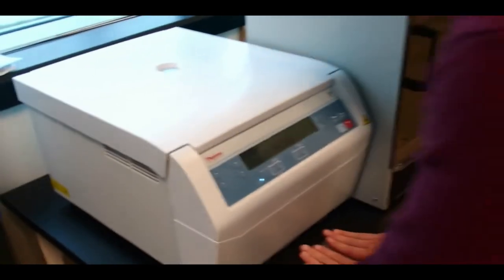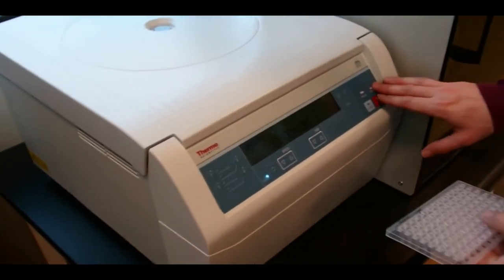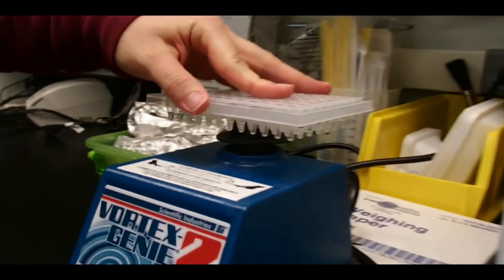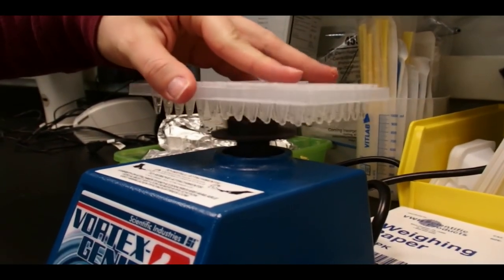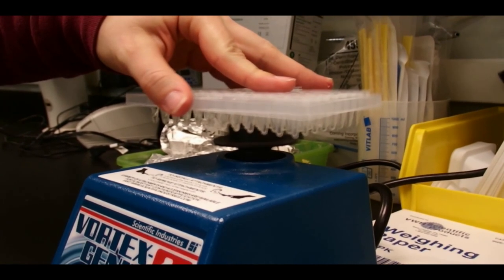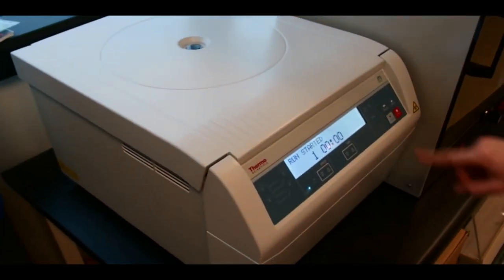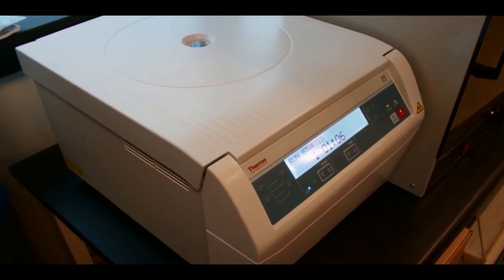All right. Now that the dilution buffer has been added, we just quickly spin this down to collect all the liquid on the bottom. The camera doesn't capture swirling very well on a vortex, but you need to see your solution move. If you see it move, it's mixed. And down again. And we're ready, and then we'll be ready to use this as a template for our genotyping reactions.